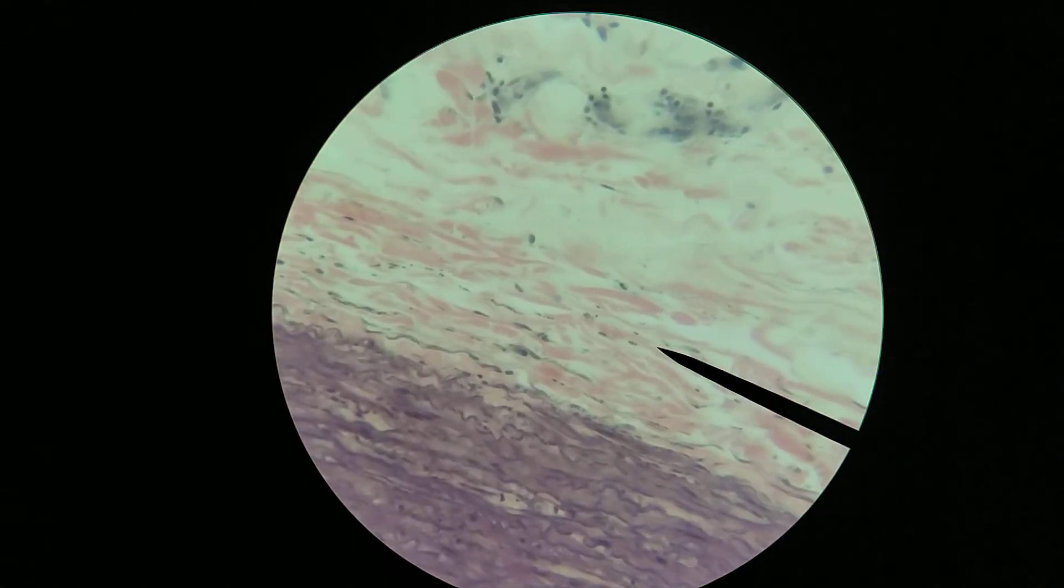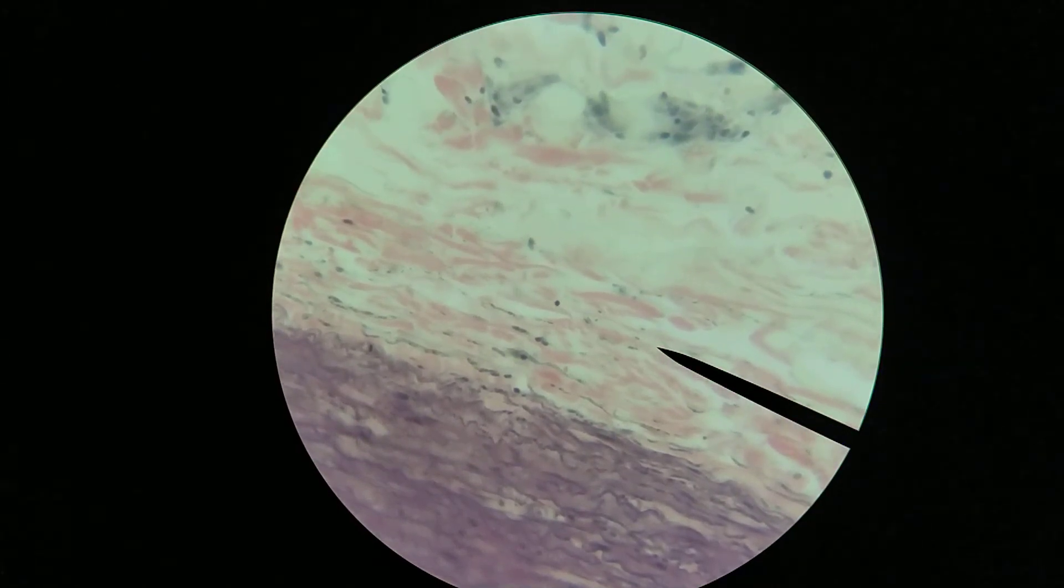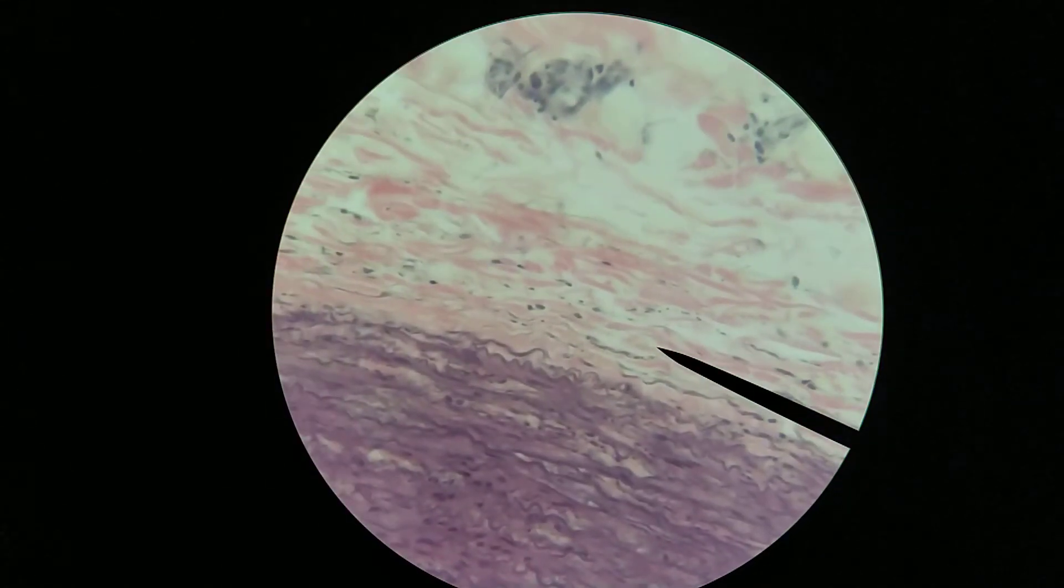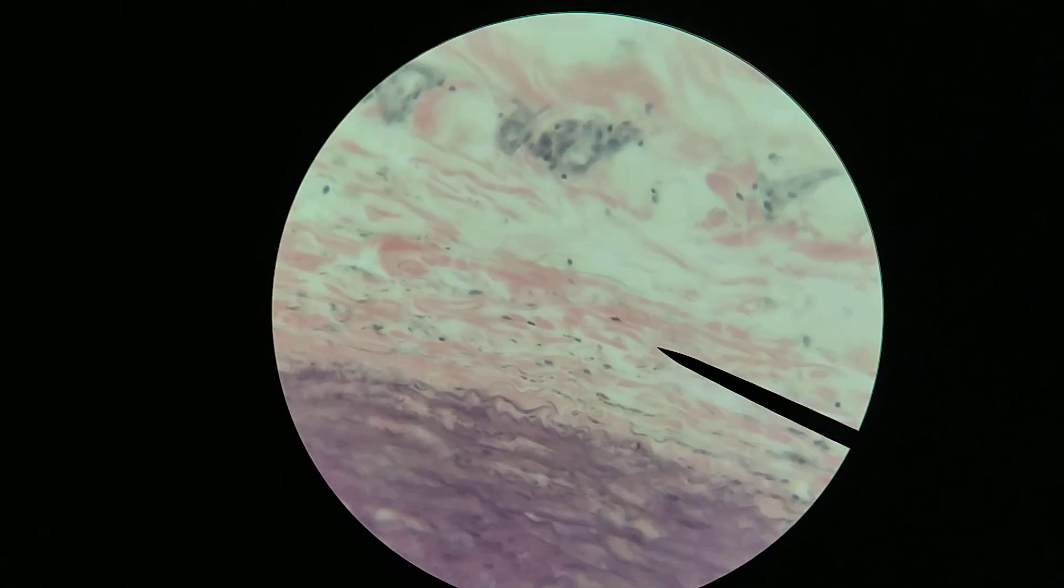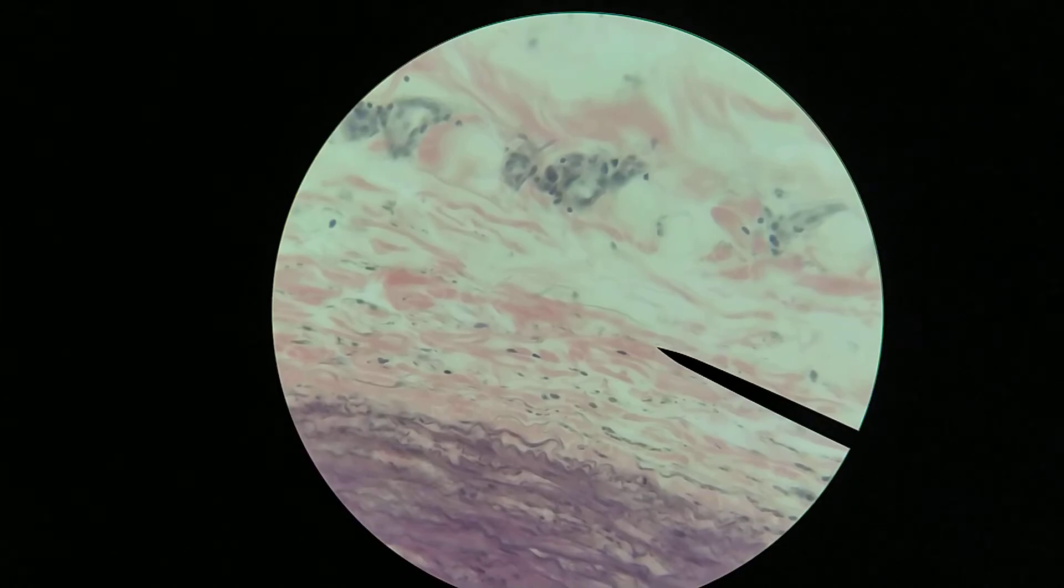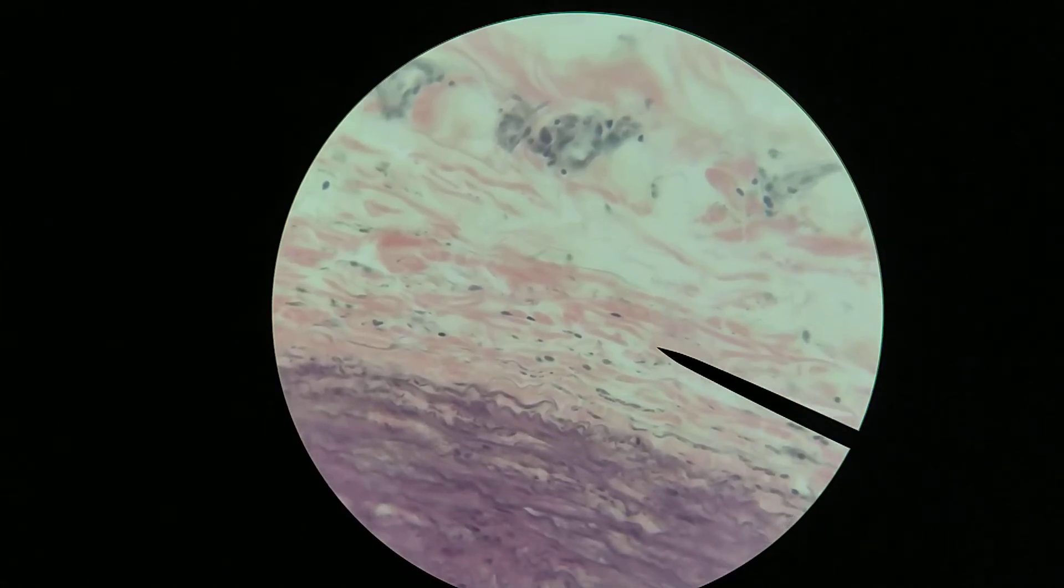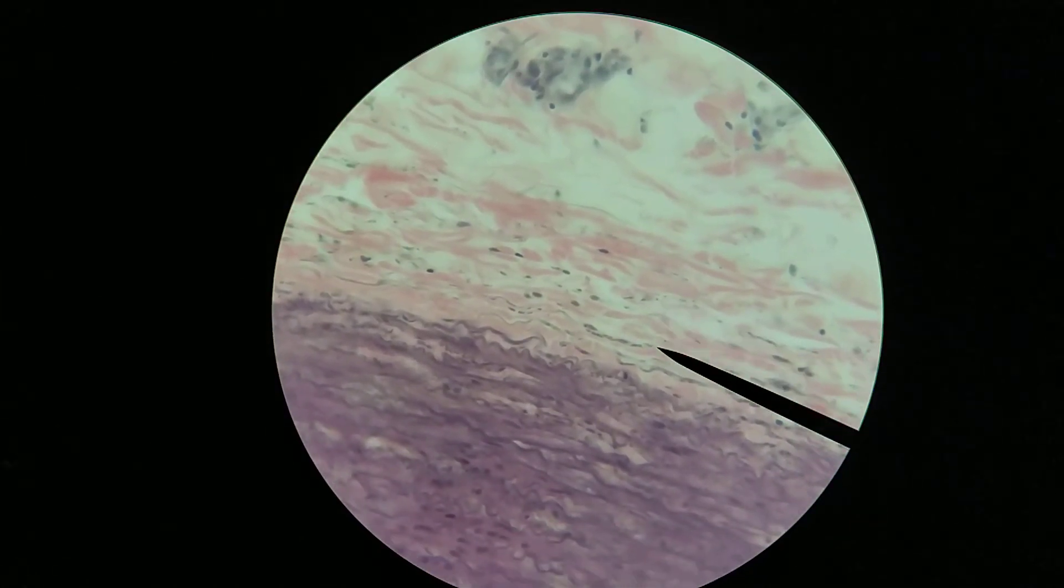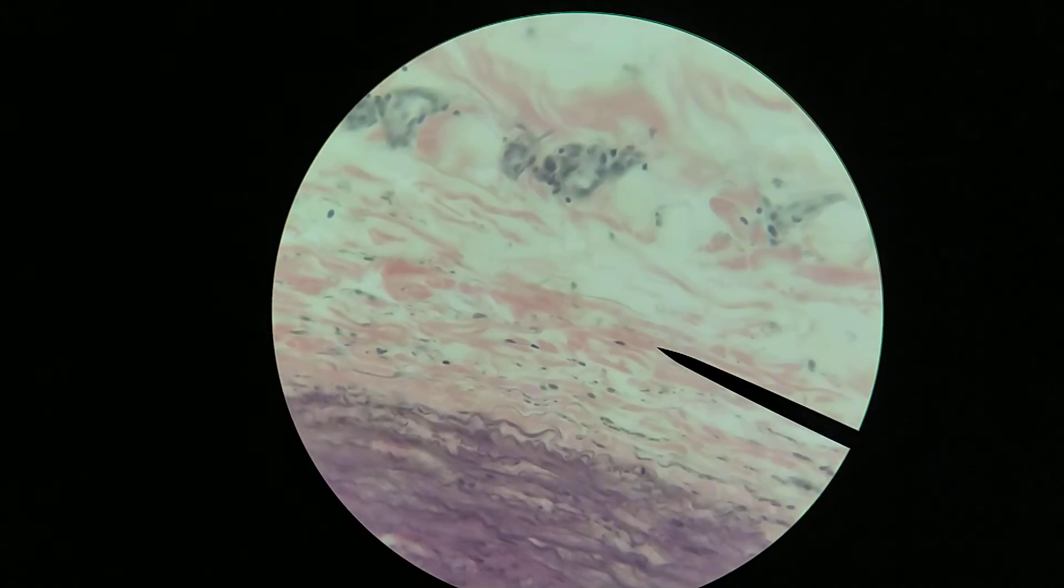And so you can see here, for example, tunica adventitia is a relatively dense irregular connective tissue. You can see the bundles of collagen are quite thick in comparison to the size of the nuclei. And they are going in different directions. So what we have here is a dense irregular connective tissue.